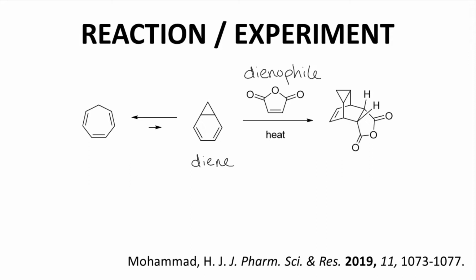With a complex polycyclic structure like our product, it can be helpful to number and label atoms. Here are the diene carbons, 1, 2, 3, 4. The dienophile includes 5 and 6. These atoms in the product should be a cyclohexene, 1, 2, 3, 4, 5, 6.